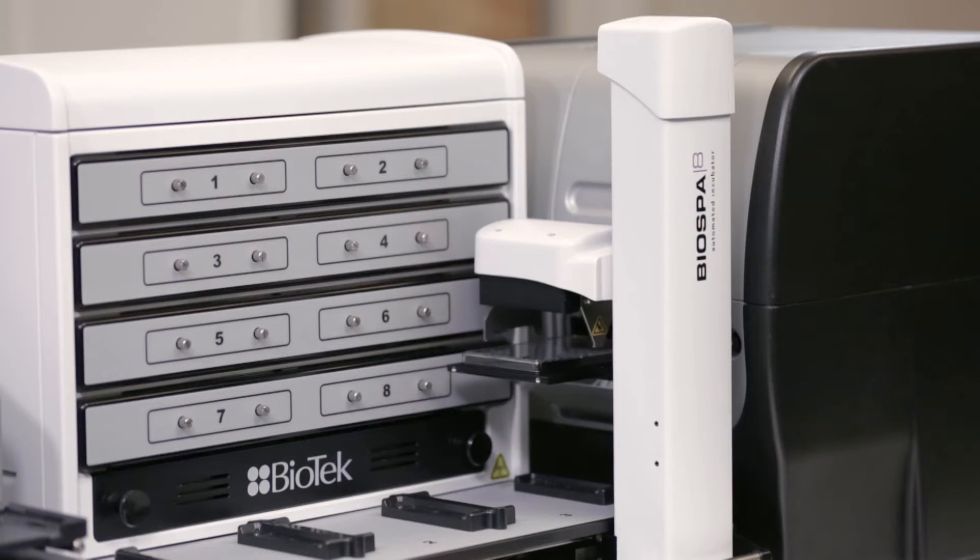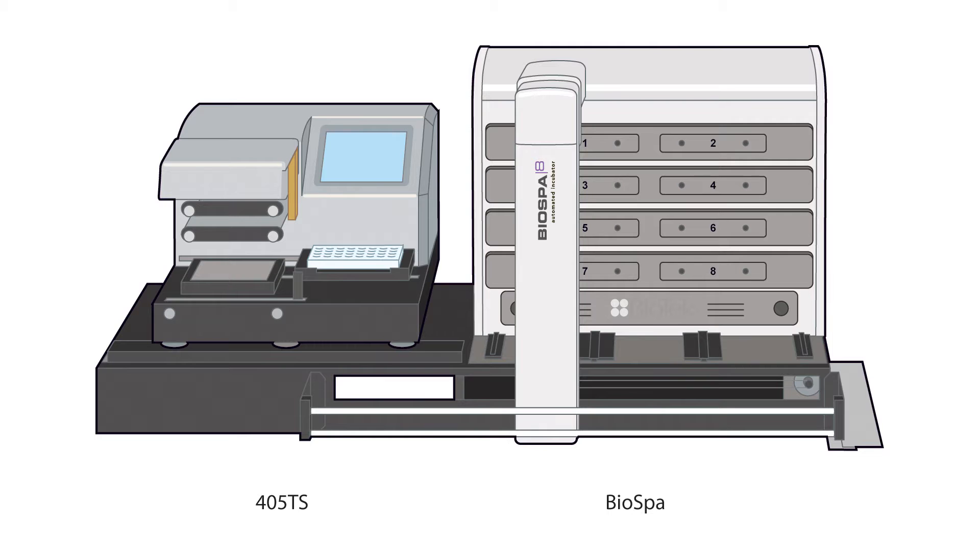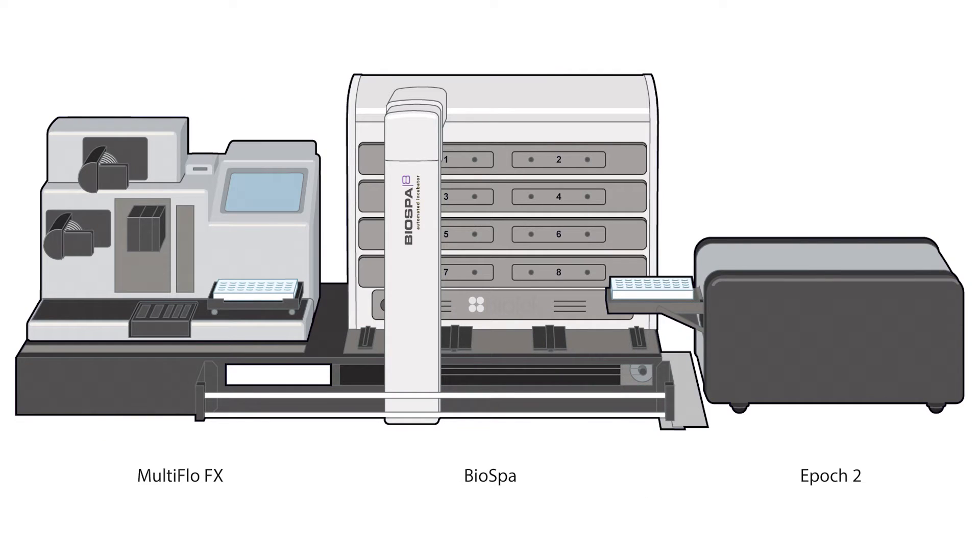BioSpa 8 is compatible with many of Biotech's instruments, allowing you to customize the system to your needs — here, for example, with liquid handling only, or here with a washer dispenser and a simple absorbance plate reader. We will see later in this video how BioSpa 8 integrates with these devices.